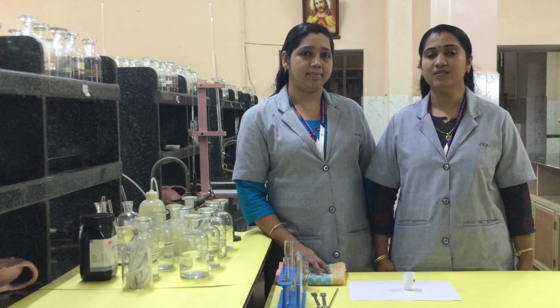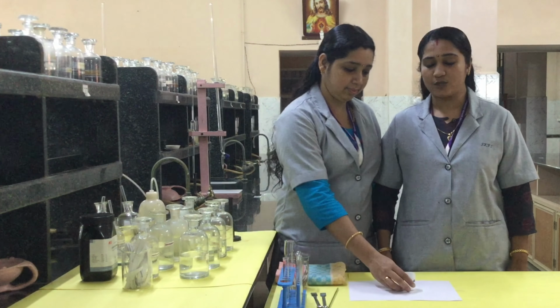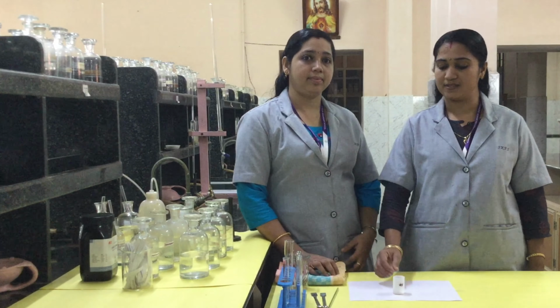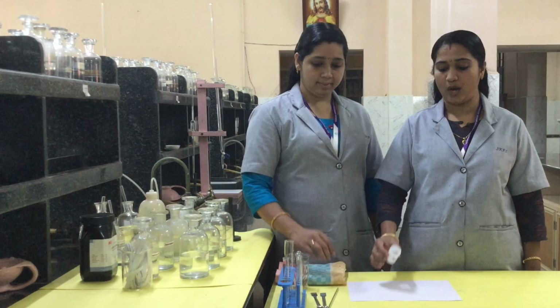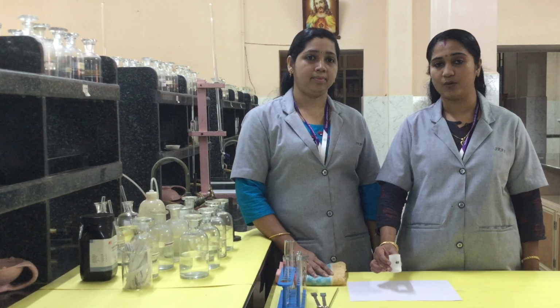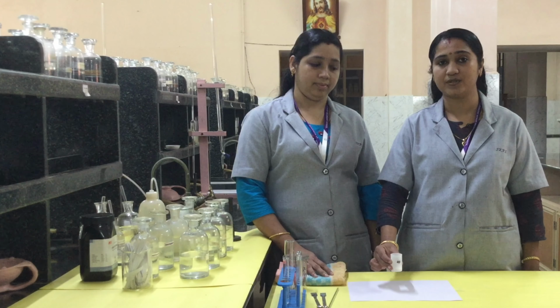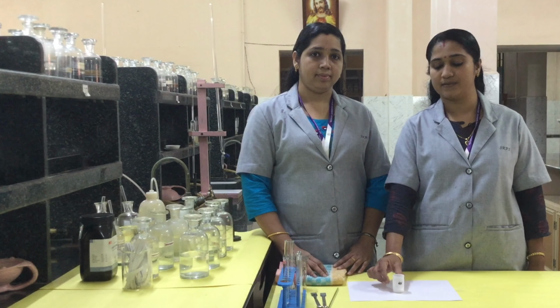Good morning children. Today's experiment is salt analysis: analysis of cations and anions present in a simple salt. You are provided with a white crystalline colorless salt. You will have to detect the presence of cations and anions. What are the cations and anions present in the simple salt?